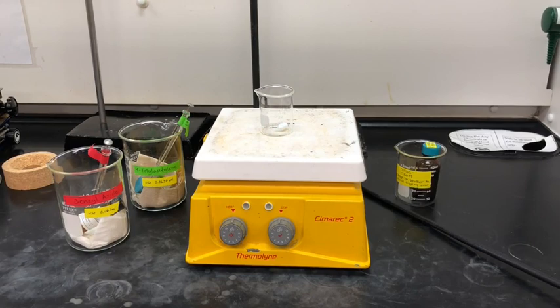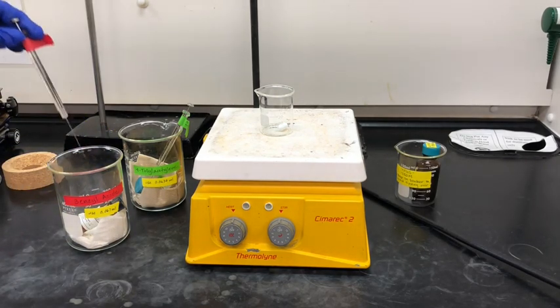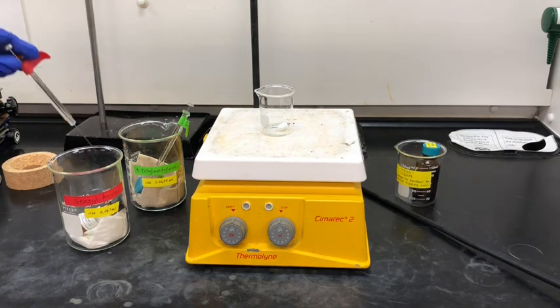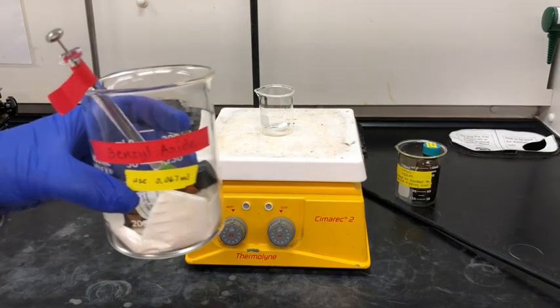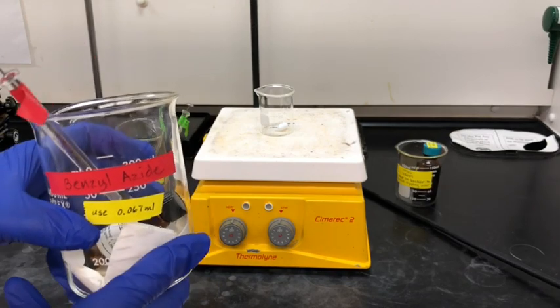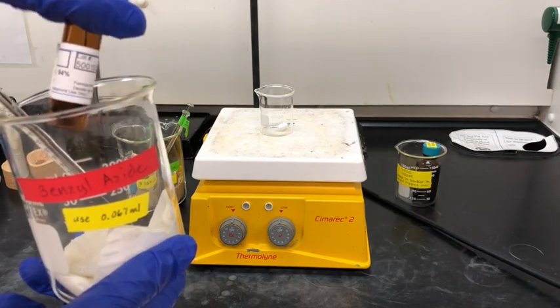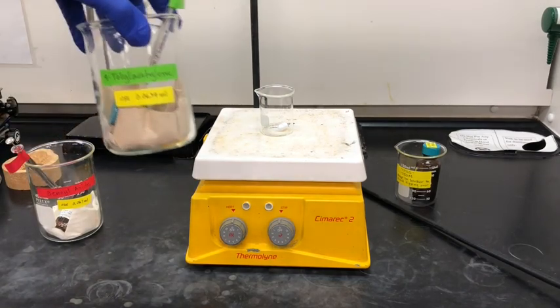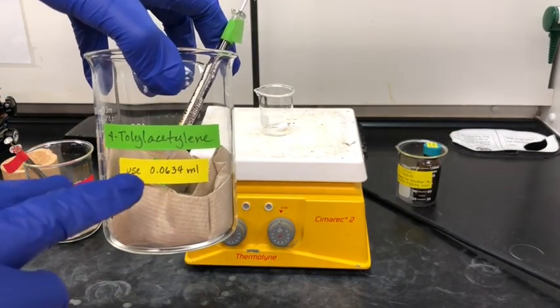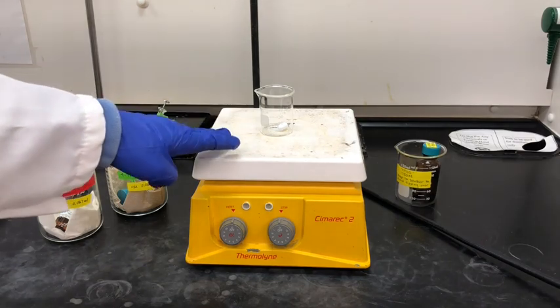In this lab you're going to start with a few different materials. You're going to start with benzyl azide — it comes with a very small syringe and you're just going to measure out about 0.067 milliliters. You'll also use 4-tolylacetylene, and you're also going to use a very small amount, so there's another small syringe that comes with that chemical.